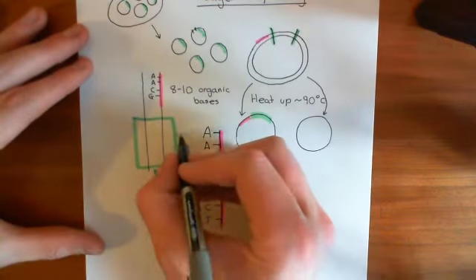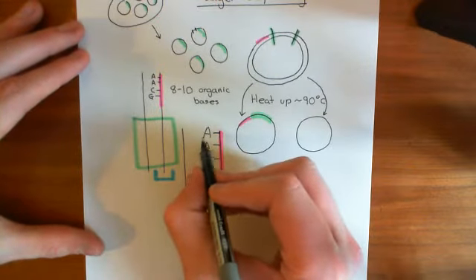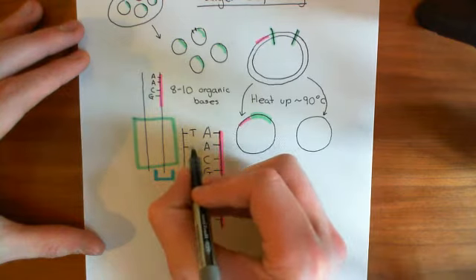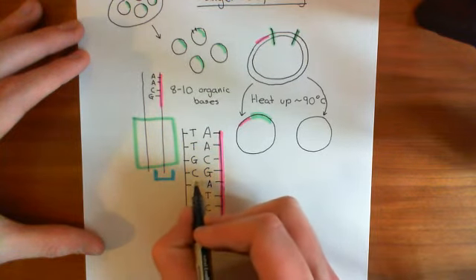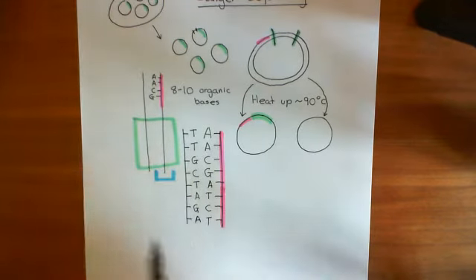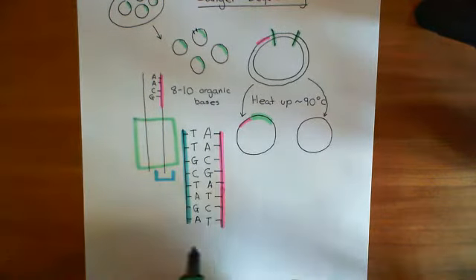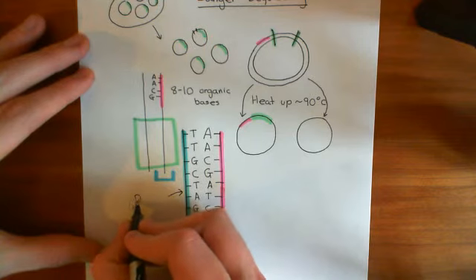We're going to create a portion of DNA which has the complementary organic bases to these. So it will have thymine here, which is complementary to adenine, thymine here, guanine here, complementary to cytosine, cytosine here, complementary to guanine, thymine here, complementary to adenine, adenine here, complementary to thymine, guanine here, complementary to cytosine, and adenine here. Now this strand, this 8 organic base long strand, this is our primer that I'm colouring now in turquoise, and it does not go beyond that. It's just these 8 organic bases together, so it's a short piece of DNA. So this is our primer.